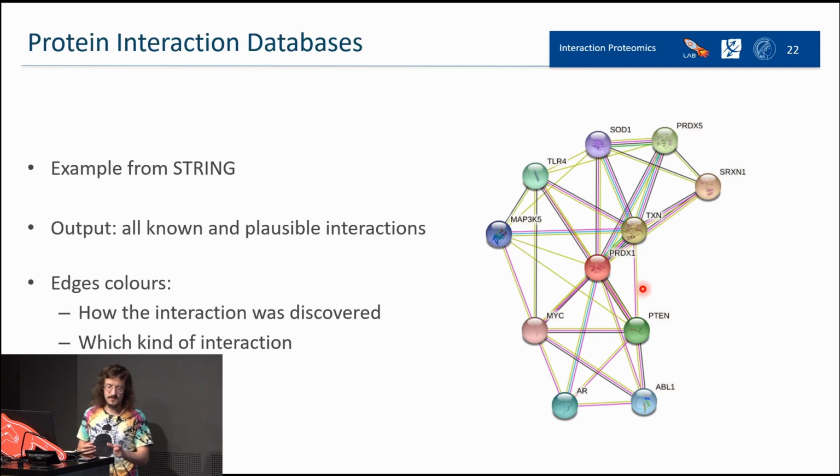For example, they know that there is a motif that usually interacts with a specific protein, and they found that motif repeated in another protein. They say an interaction probably happens between these two, but there are no experiments showing with 100% certainty that this interaction is actually happening.